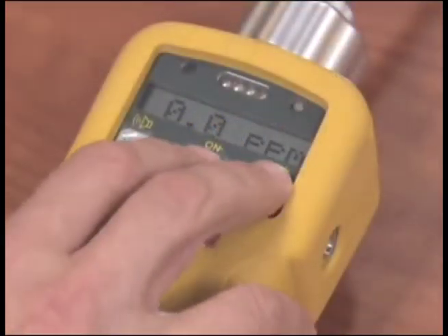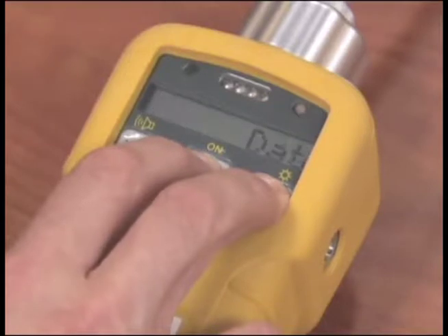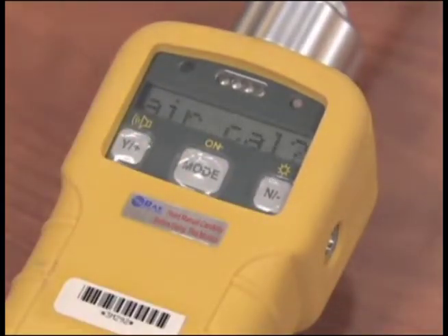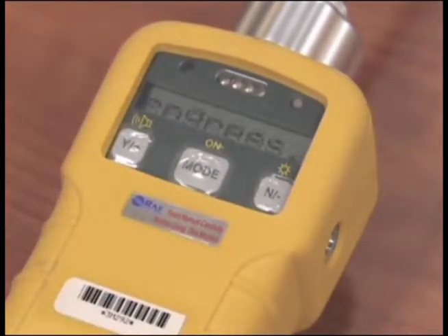To re-zero the instrument, press the Mode button and the N button at the same time and hold until Data Log Paused appears on the screen. This will stop the unit from data logging and the unit will ask you if you want to calibrate. Push the Y button. The unit will ask you if you want zero air calibration. Push the Y button again. The unit will begin zero air calibration while you install the zero carbon filter.